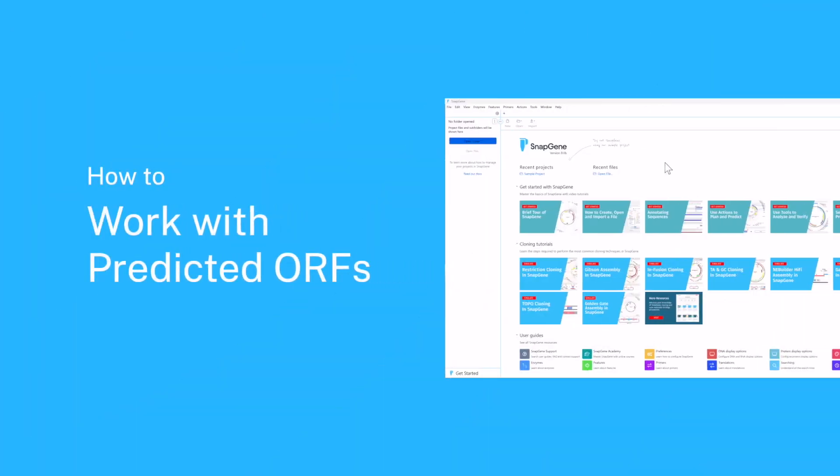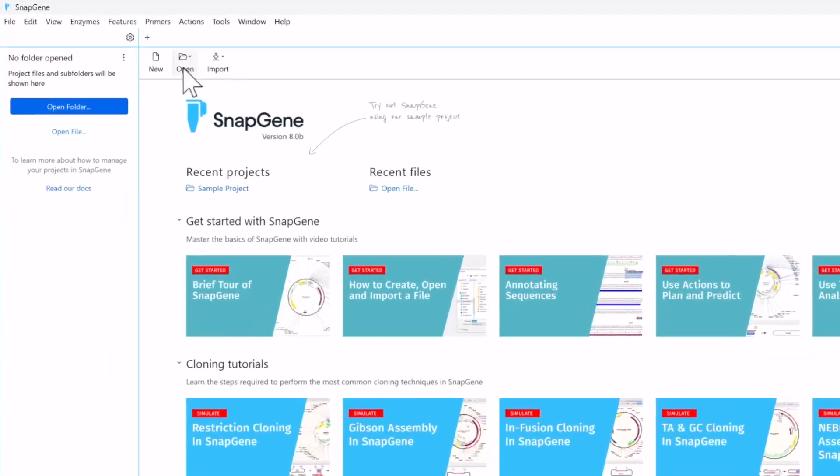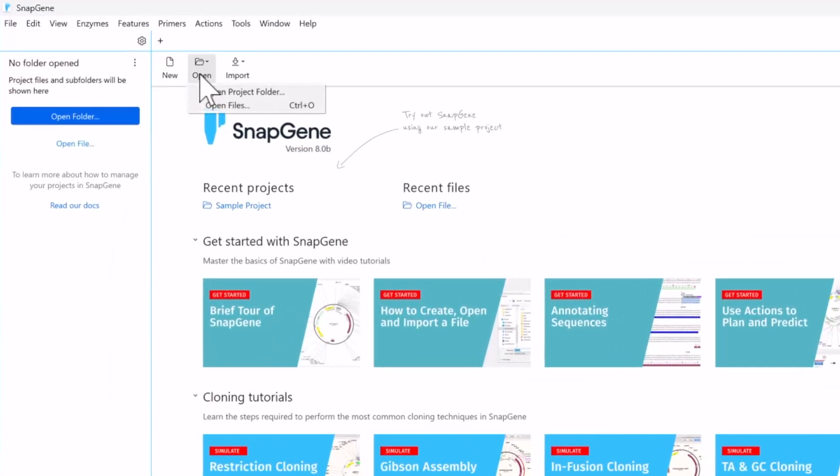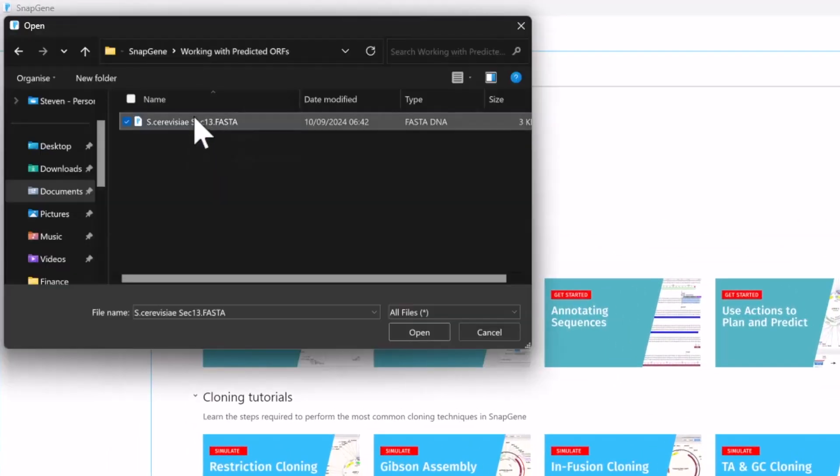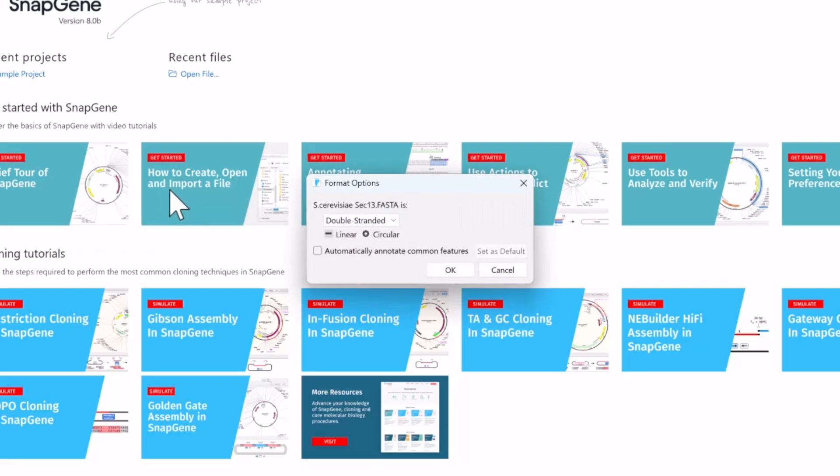Welcome to this video on detecting simple open reading frames that do not contain introns. For this example, I will start by importing a FASTA file with no feature information, but I know it includes the Saccharomyces sec13 gene.